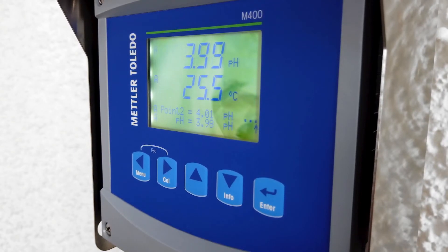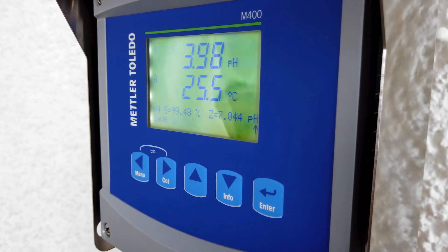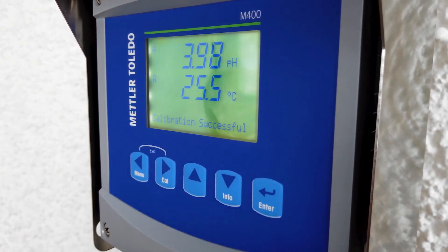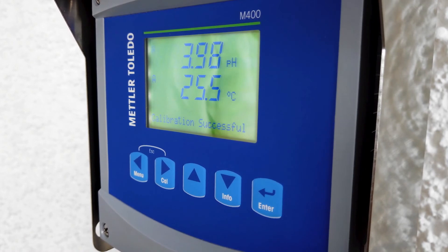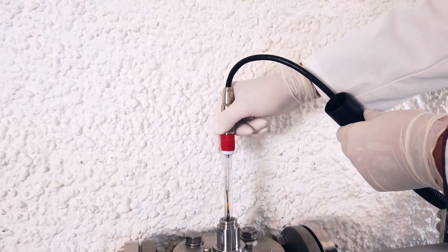Now you can see on the M400 transmitter that the sensor was calibrated with the displayed slope in percentage value and a zero point and pH value. You can now adjust the sensor by clicking enter. This saves the calibration data and stores the values for the zero point and slope on the transmitter.